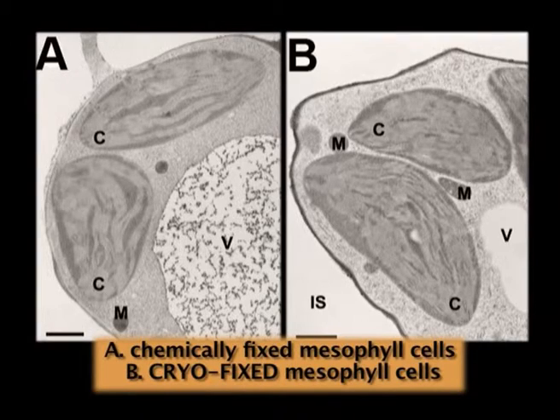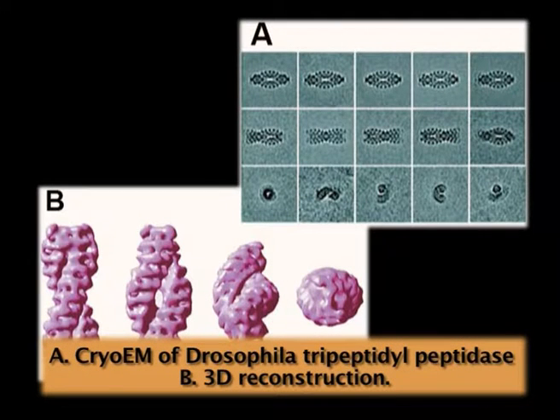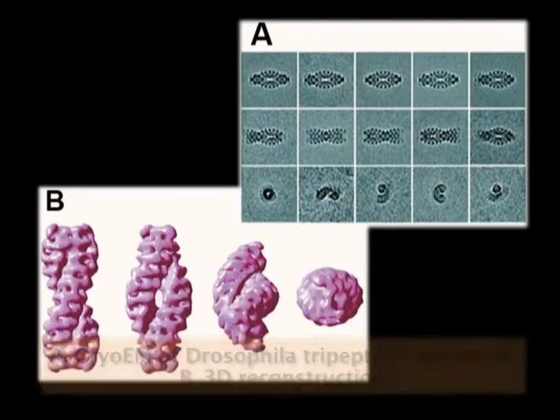Most recently, what people do is cryofixation for cryo-electron microscopy. Now, one of the important advantages of cryo-electron microscopy is that the artifacts which come due to sample preparation in conventional electron microscopy can be removed in most cases, where the samples are plunged in liquid nitrogen.